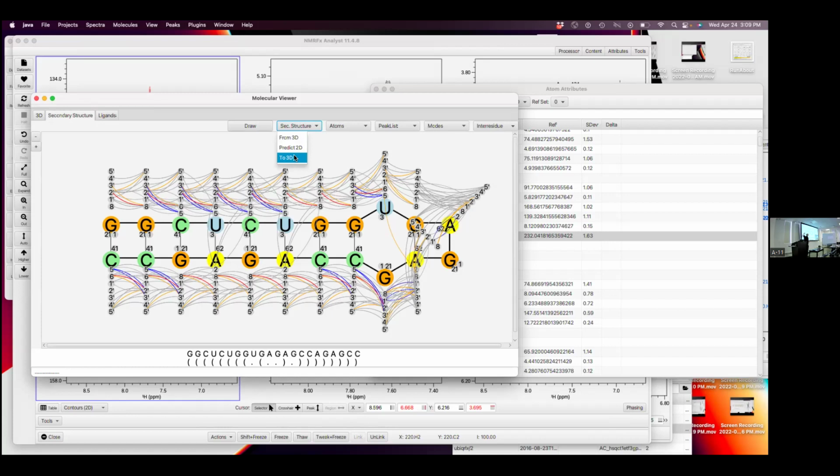it'll look at an RNA and say, okay, from the secondary structure, this is the helix. So the structure calculator, if you're familiar with programs like CYANA or XPLOR running in torsion angle mode, you're not moving 3D coordinates of atoms, you're just rotating bonds. And so you basically have to have a tree that starts here, goes all the way up and back to here. That makes it hard to predefine components. So what we do is we look at the secondary structure and say, okay, this connects up here, connects up to here, connects up to here, and this is the end of the helix.